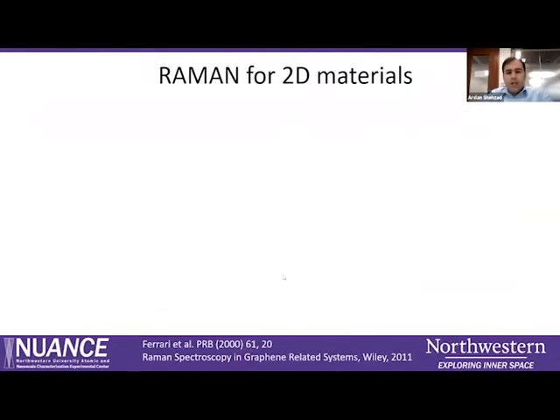With that, I'll be looking into a little bit of the Raman perspective. Raman has become a very essential tool for all these 2D materials because it gives you the phonon vibration modes of different 2D materials. This started from Ferrari's work right around 2000. Even before the discovery of graphene, he discovered that these phonon vibrations at particular modes can be utilized to determine different thicknesses of a material.